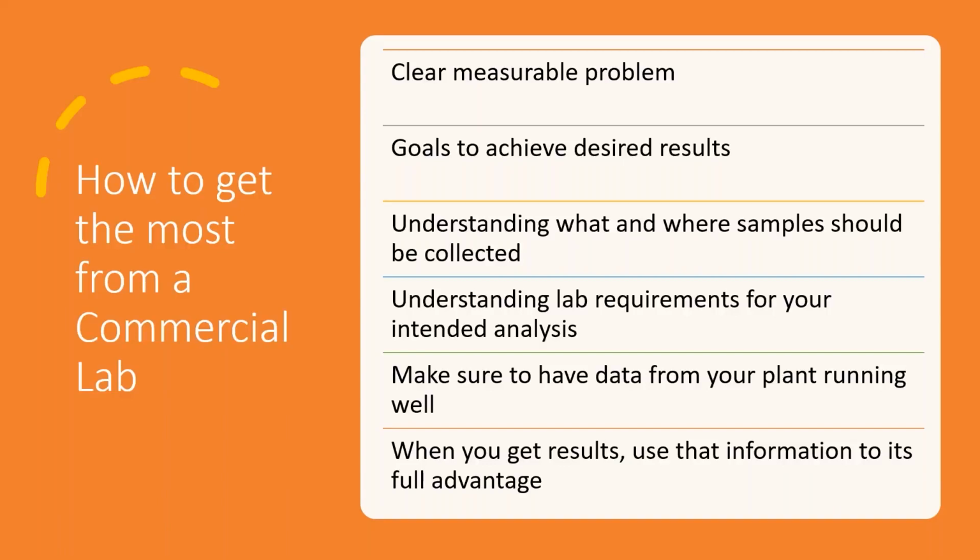And so in getting the most from your lab, that's the most important thing for quality. You have to know where samples have to be taken. You have to know how they should be collected. You have to know how they should be stabilized, if they should be stabilized, and how quickly they have to get to the lab in order to get good results. And then the lab will take it from there and do the testing, getting results. And the final thing you have to do is to make sure, if you get directions from your consultants or your lab, that you follow those directions specifically.